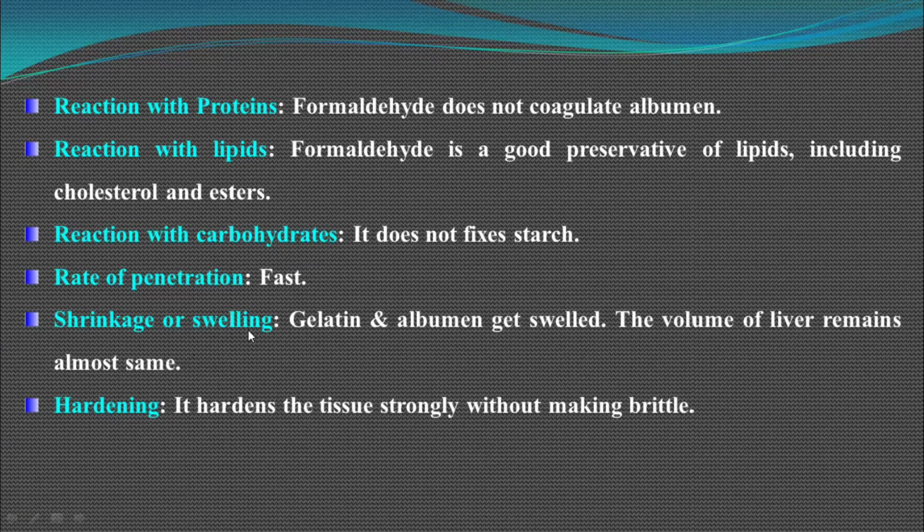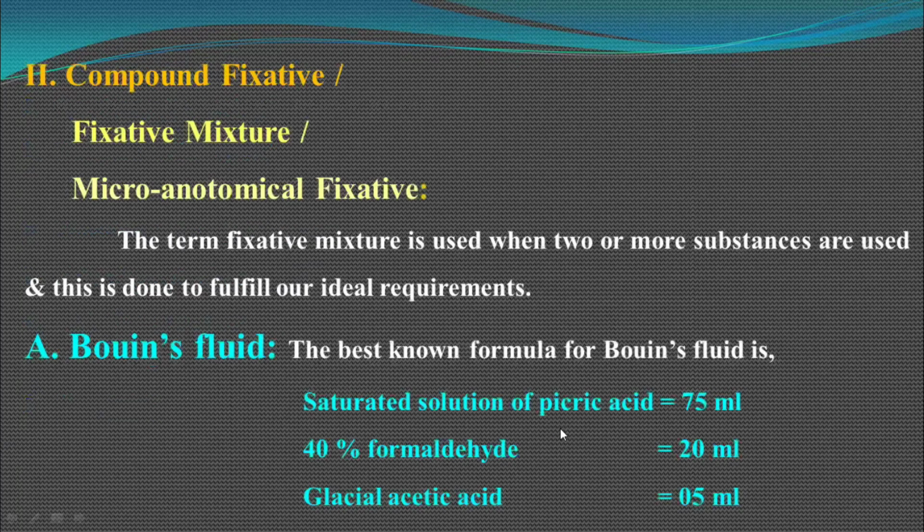About shrinkage or swelling of tissue, that is osmotic effect: gelatin and albumin get swelled in formaldehyde. The volume of liver remains almost the same. The tissue hardens strongly without becoming brittle. So we will stop here.